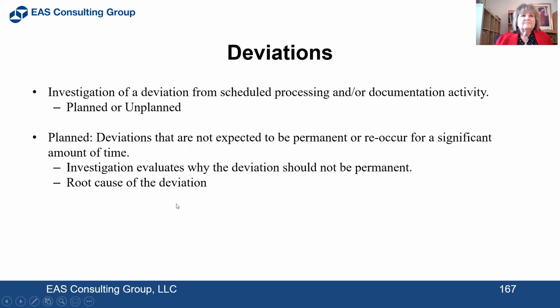So, deviations. Investigation of a deviation from scheduled processing and/or documentation activity. You can have planned or unplanned deviations. A planned deviation is not expected to be permanent or recur for a significant amount of time.